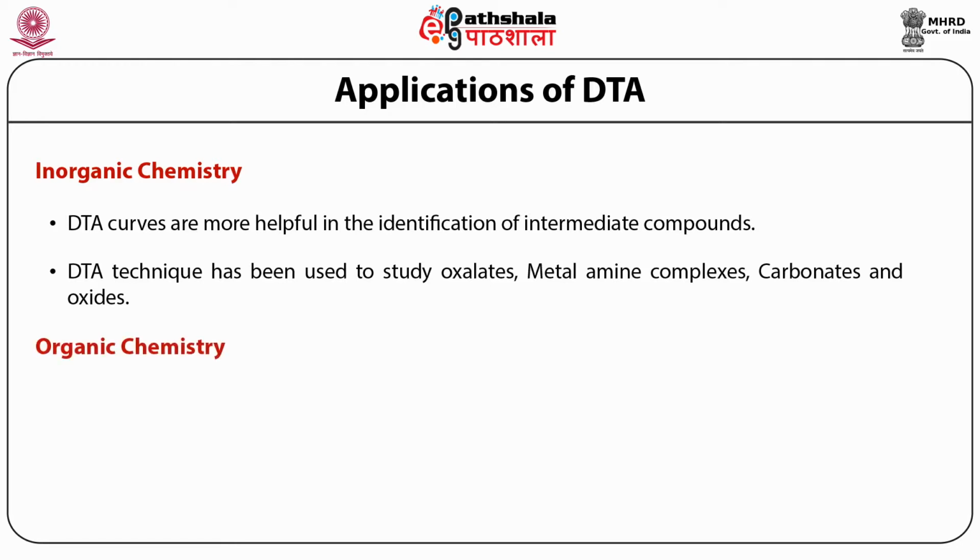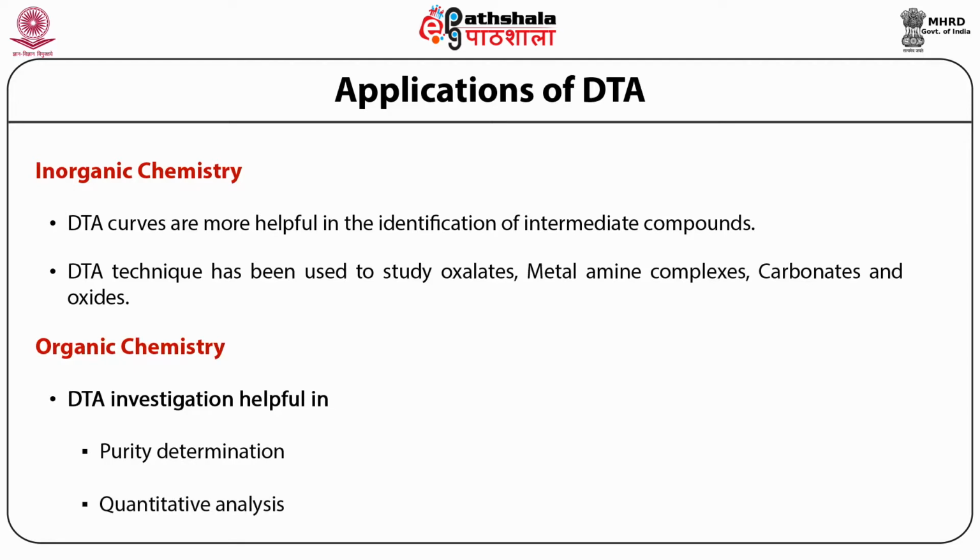Applications to organic chemistry. DTA investigations have been carried out to help identification, purity determination, and quantitative analysis, including the evaluation of kinetic parameters of polymers, explosives, pharmaceuticals, oils, fats, and other organic chemicals.